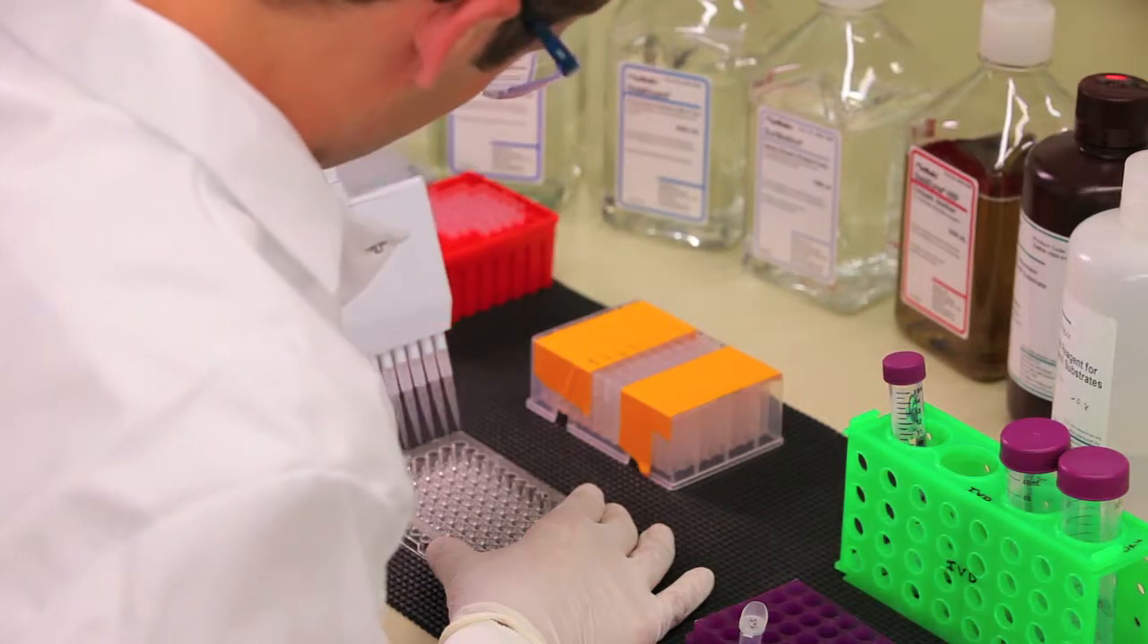Serially dilute your standard material using Surmodics Assay Diluent, which can be easily incorporated into any assay format. Using Surmodics Assay Diluent will help reduce nonspecific binding, as well as matrix interferences and should be used for both the standard curve and samples.